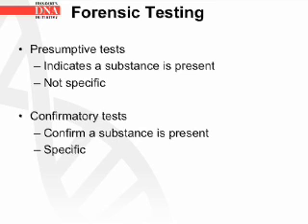Here are two common terms that will be used a lot in forensic testing. First, presumptive tests. These indicate a substance is present and they are not specific. The second term is confirmatory tests. These confirm a substance is present and are very specific.